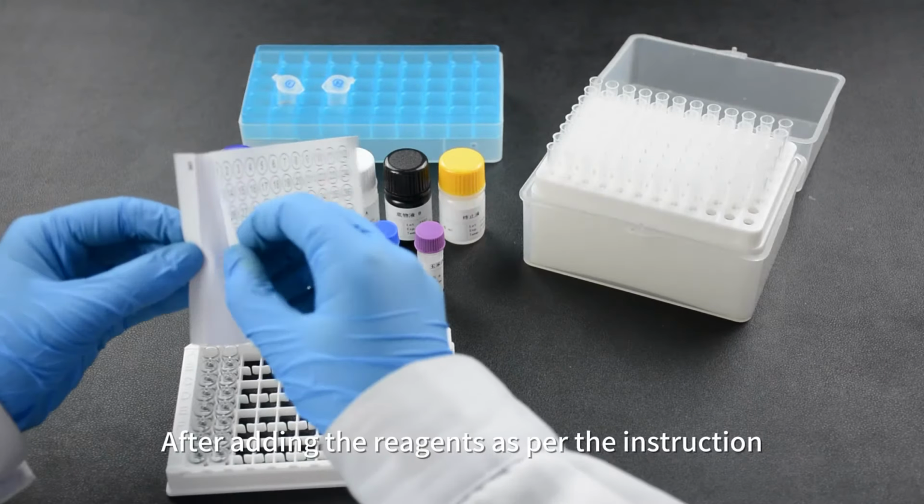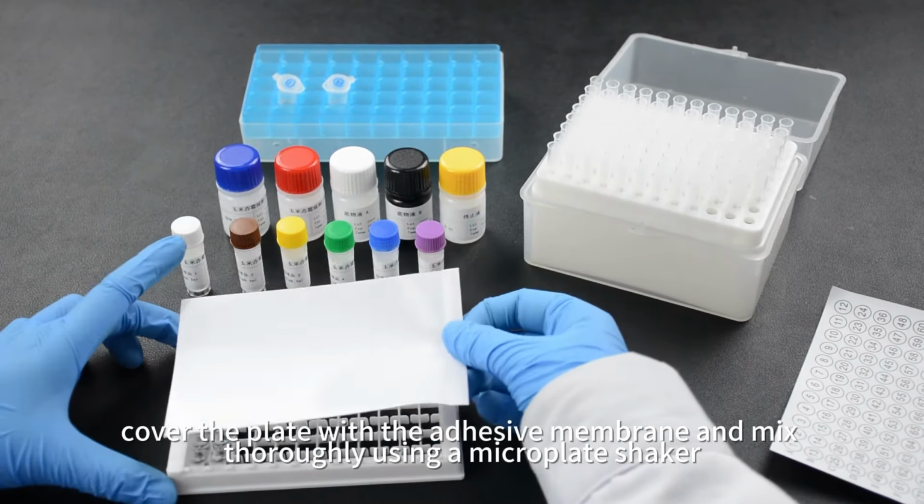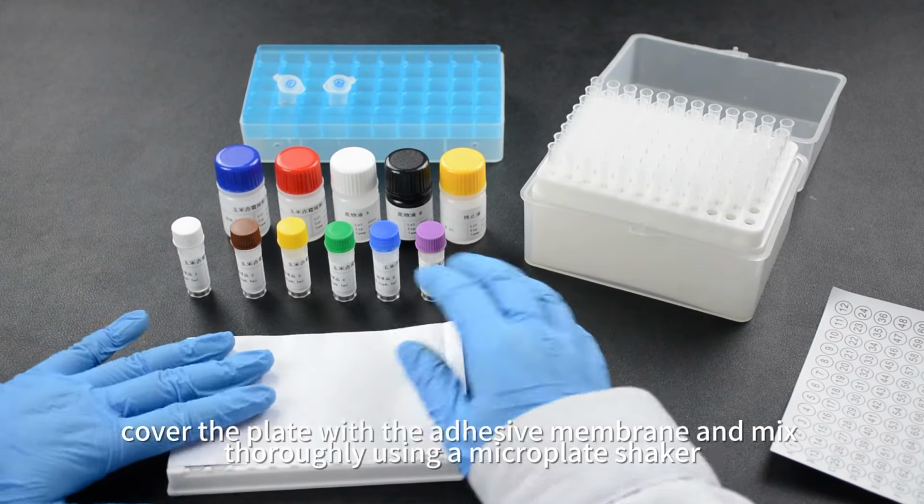After adding the reagents as per the instruction, cover the plate with the adhesive membrane and mix thoroughly using a microplate shaker.